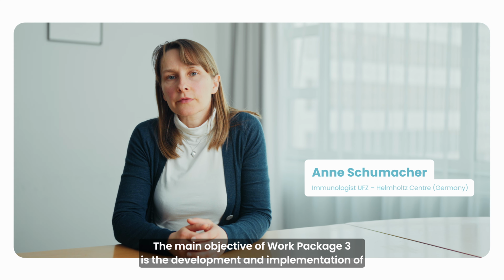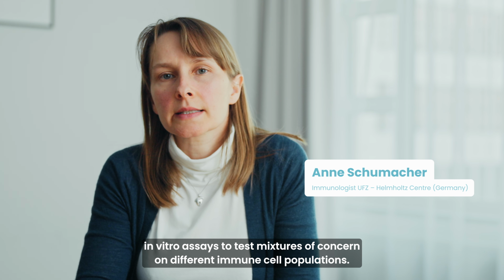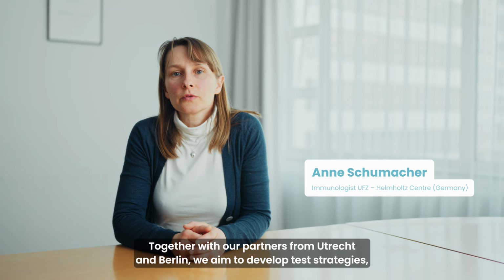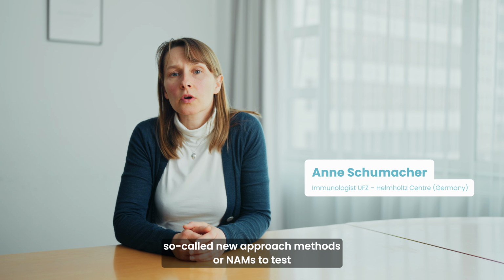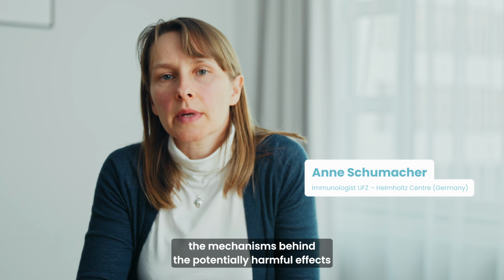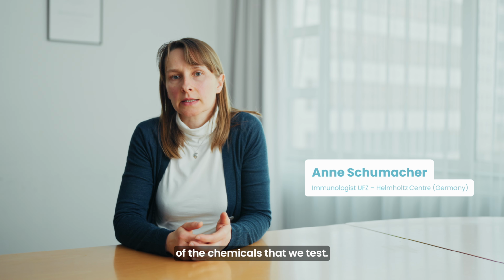The main objective of Work Package 3 is the development and implementation of in vitro assays to test mixtures of concern on different immune cell populations. Together with our partners from Utrecht and Berlin, we aim to develop test strategies, so-called new approach methods, or short NAMs, to test which immune cell populations are the most affected and what are the mechanisms behind the potential harmful effects of the chemicals that we test.